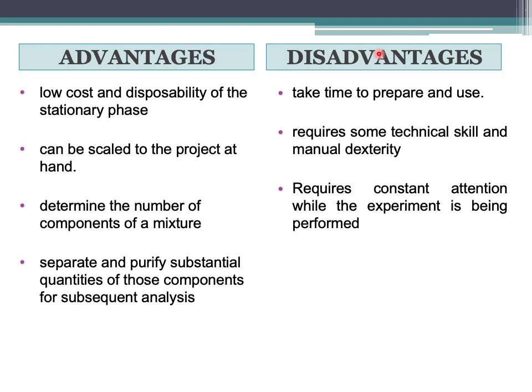But disadvantages of column chromatography, okay, it takes time to prepare and use. Dia ambil masa untuk prepare dan guna. It requires some technical skill and manual dexterity. It requires constant attention while the experiment is being performed.